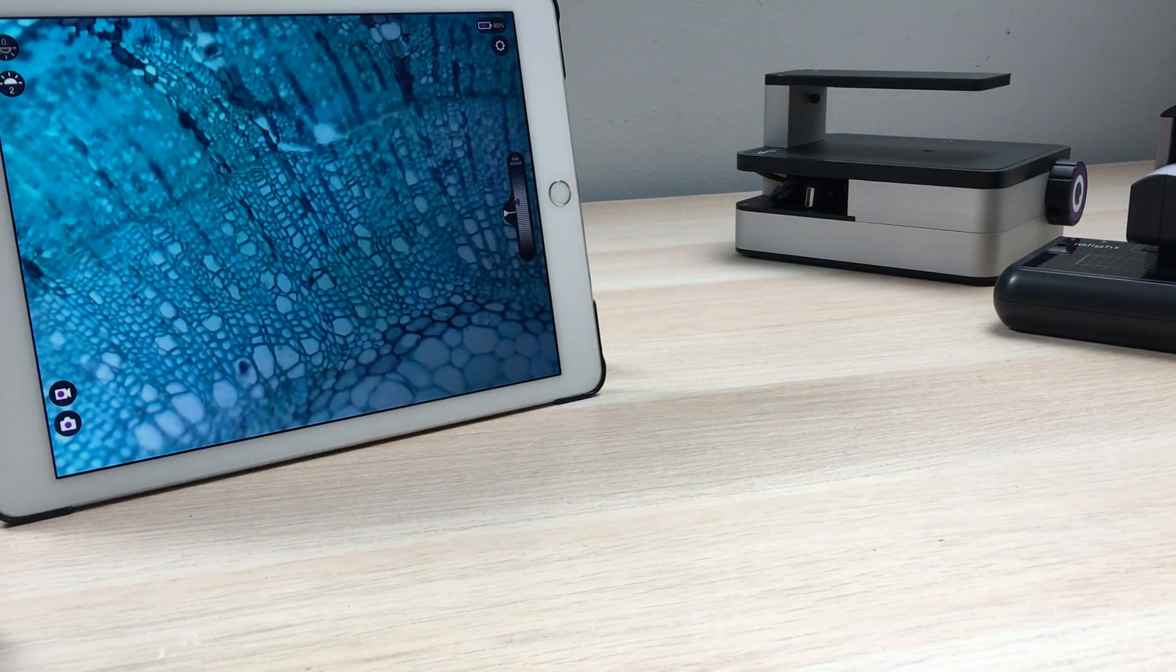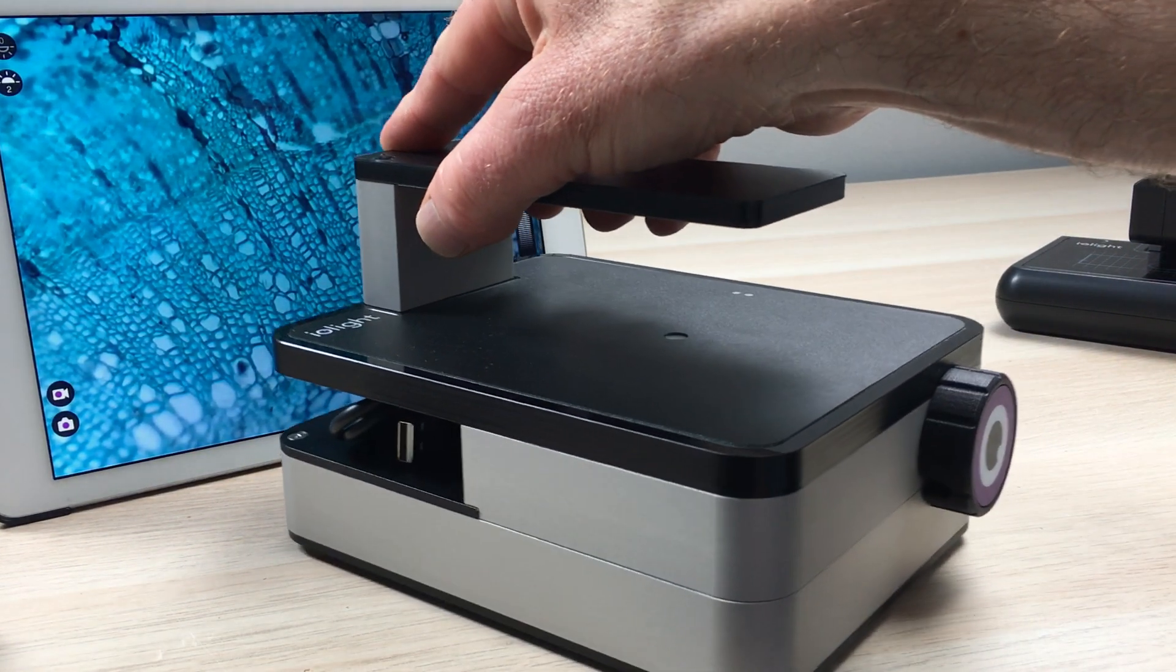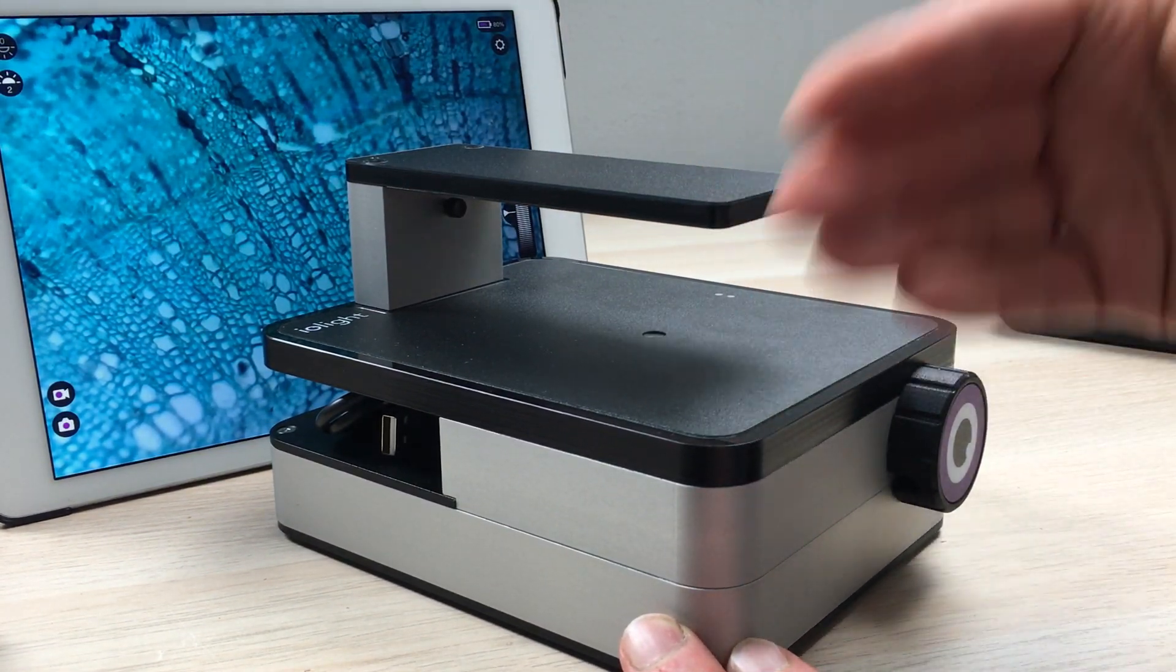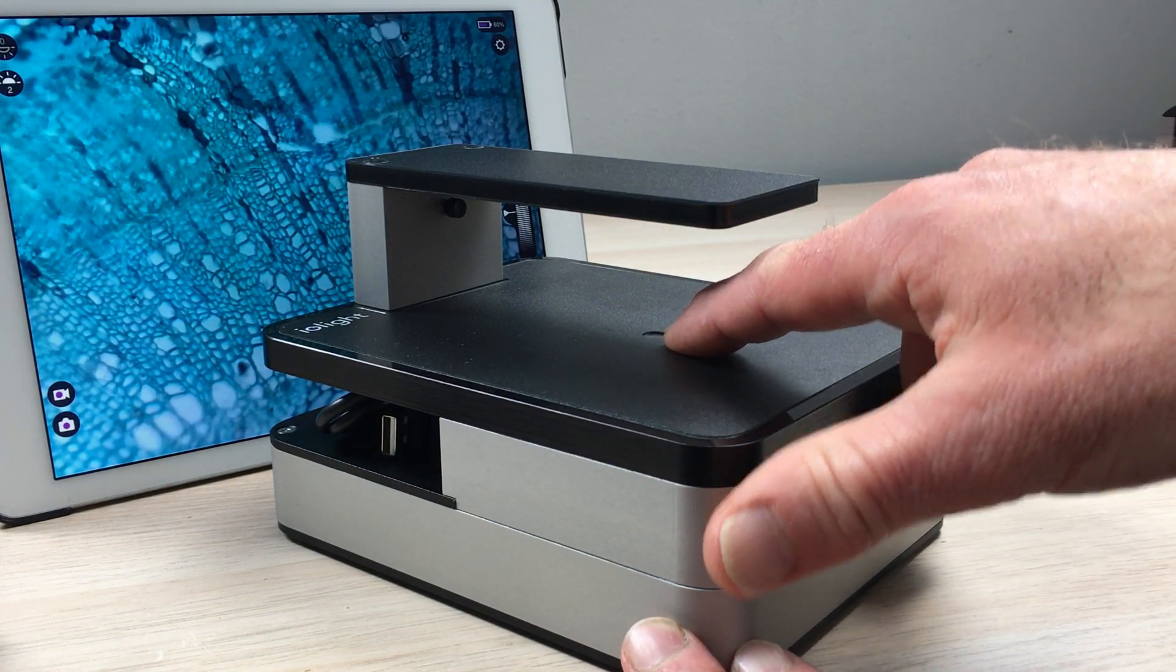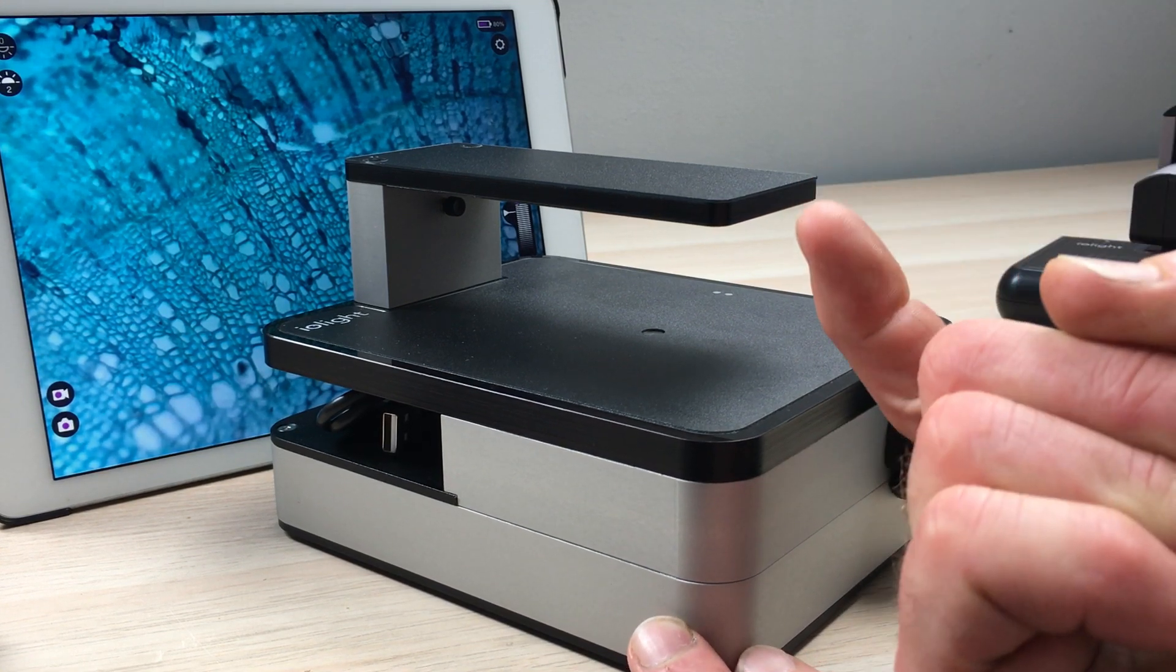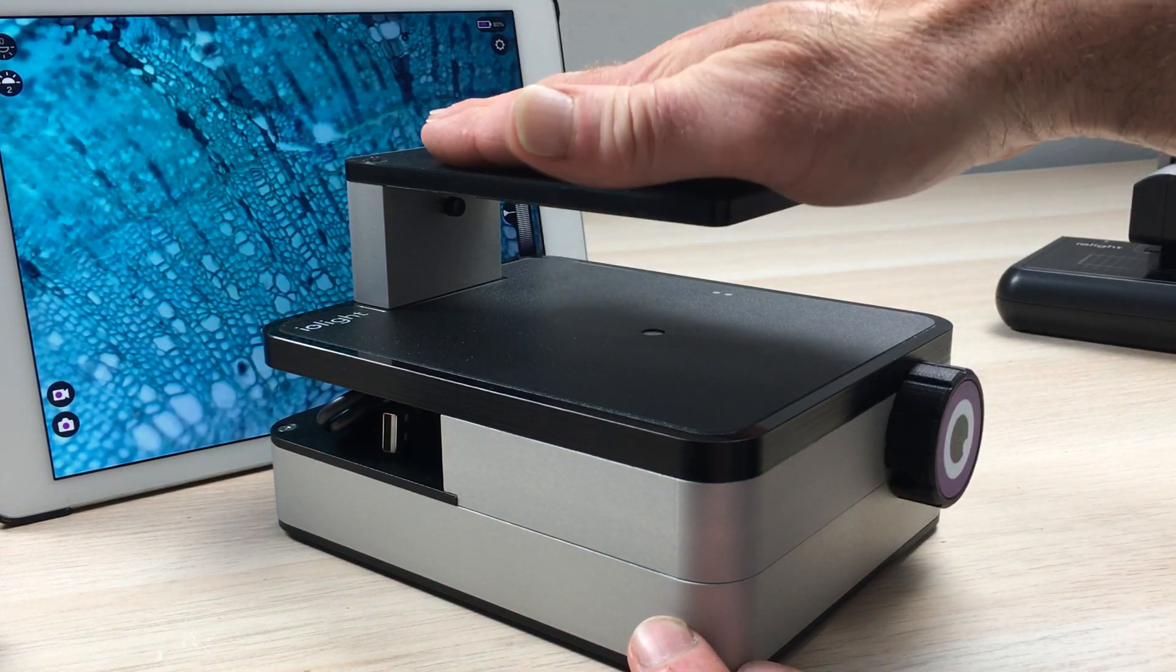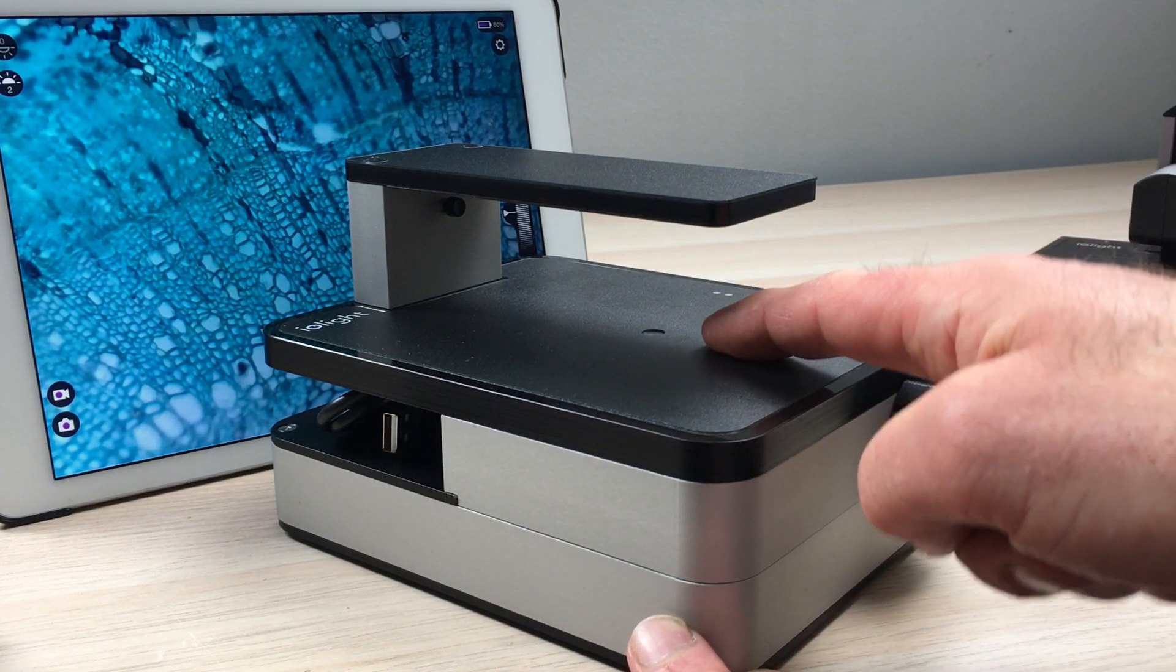The final microscope is a benchtop inverted microscope, so it's slightly larger but still very compact, you can see in relation to my hand. The microscope takes the images looking up through the bottom of the sample and you have illumination from above, transmitted and reflected illumination from around the lens.